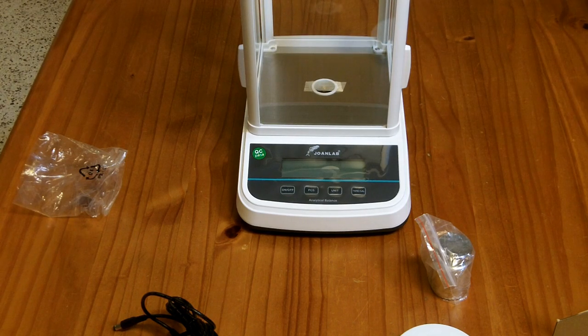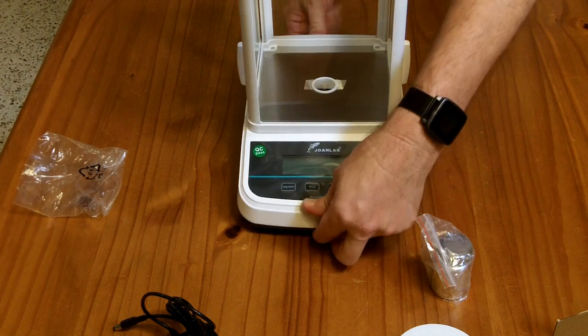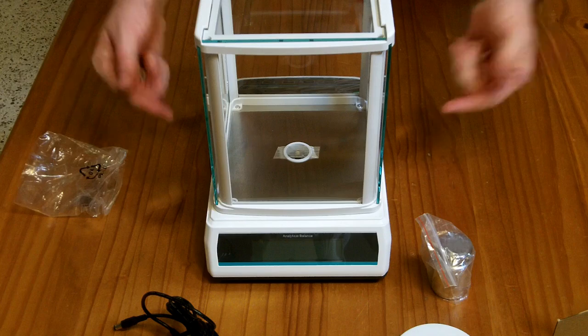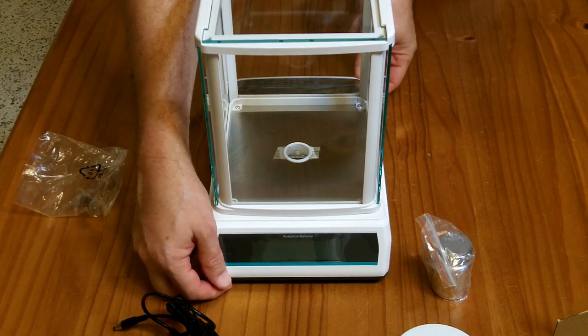Now an interesting feature of this scale is that it has a display on the back so you can read the display while working on the opposite side of the scale.